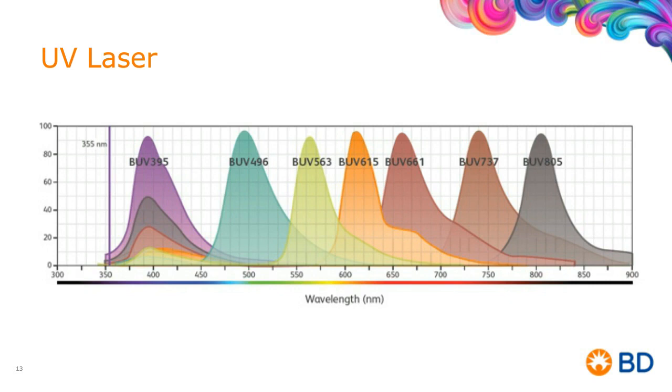And on that slide, although I moved through it quickly, which is just one snapshot of thousands and thousands of data points, you can see the upregulation of H2. You can see lots of different markers that move. So I think with this new data, when we look at so many markers at once, we may end up reclassifying certain markers from secondaries into tertiaries.